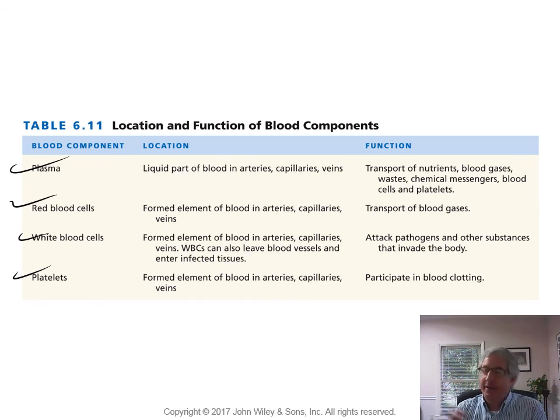You kind of squeeze blood into this category because there's no other place to put it. It's not a muscle, it's not nervous tissue, and it's not epithelial tissue. So it's got to be connective tissue. All right, next slide.